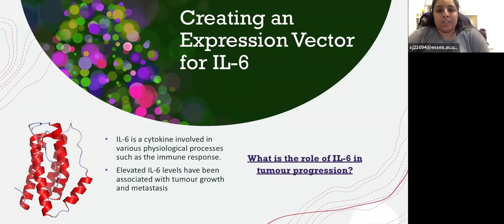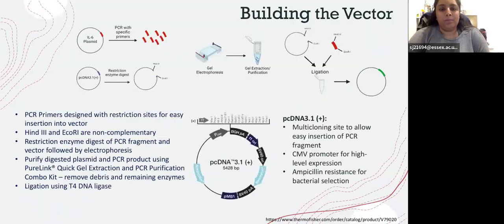In this presentation, I'll be talking through the creation of an expression vector for interleukin-6 that can be used to study the role of interleukin-6 in tumor progression. First of all, I'll start off by building the vector.